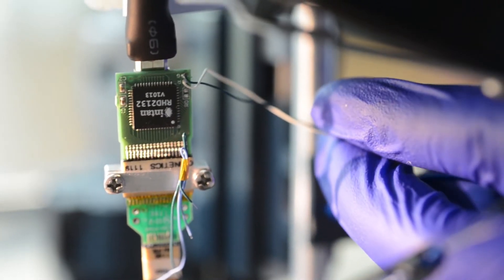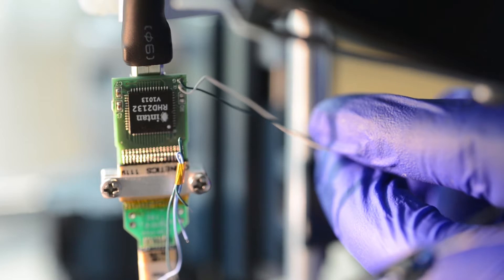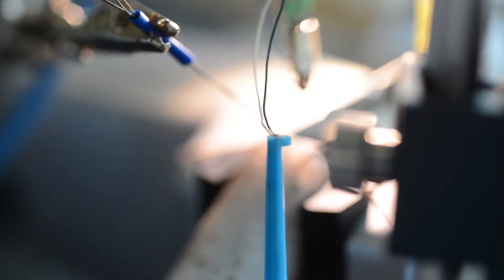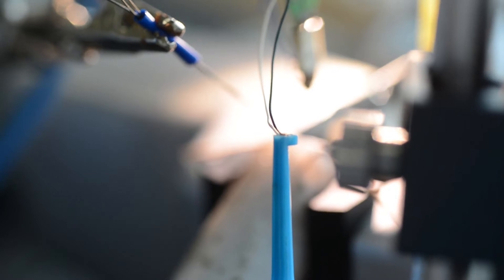Neuronexus offers a variety of smart link head stage options to match the type of experiment you are conducting, as well as the probes you are using. To obtain good neural signals, please use correct reference and ground connections.